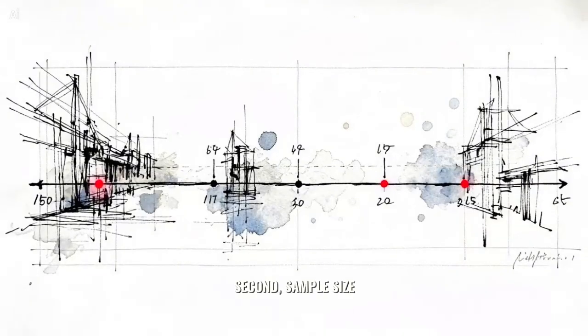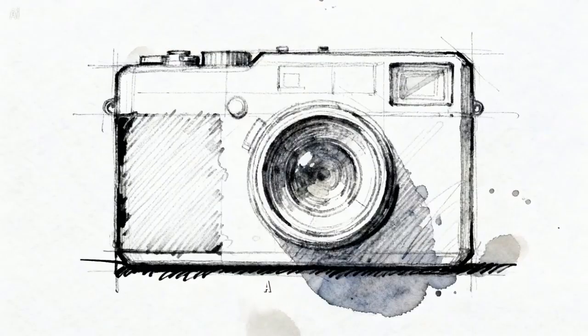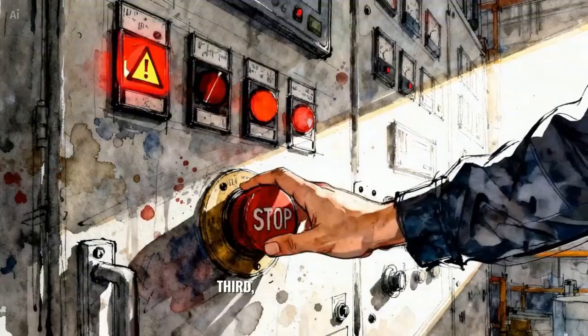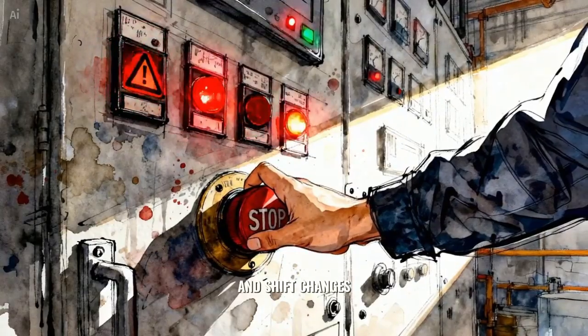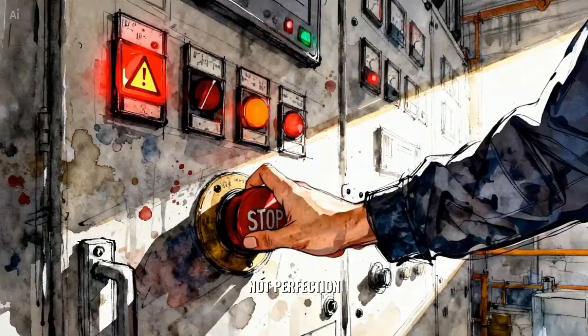Second, sample size and strategy. For example, using approximately 3,000 units for robust validation, sampling across the start, middle, and end of production. If you sample only one moment, you're not validating a process. You're capturing a snapshot. Third, include challenge conditions like line stoppages, operator interventions, and shift changes. Strong validation happens under stress, not perfection.